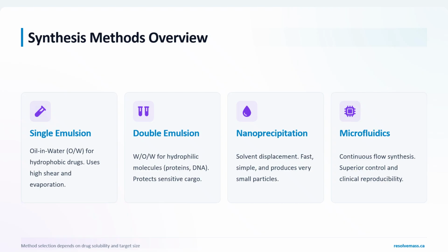Nanoprecipitation is known for its simplicity and ability to produce very small nanoparticles, and microfluidics provides highly controlled and reproducible particle synthesis, especially useful in clinical manufacturing.